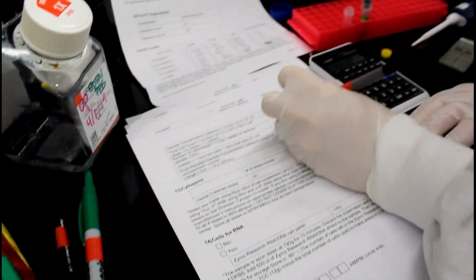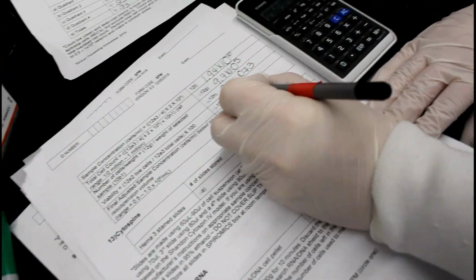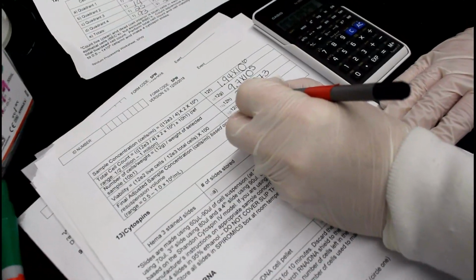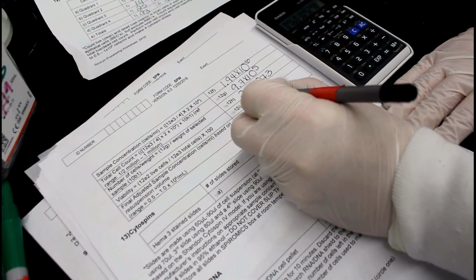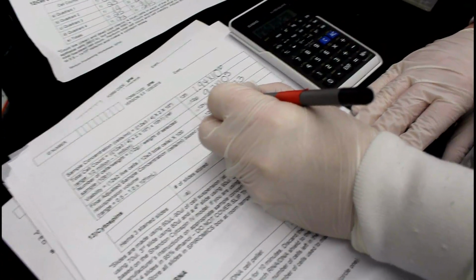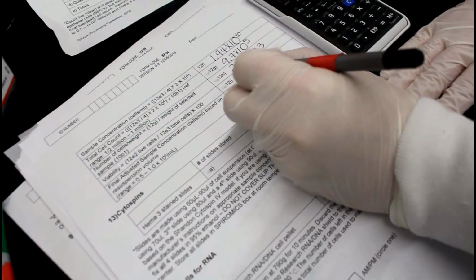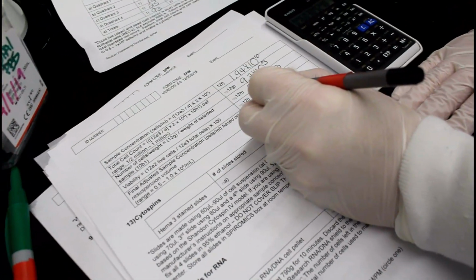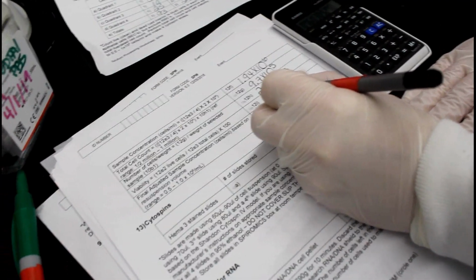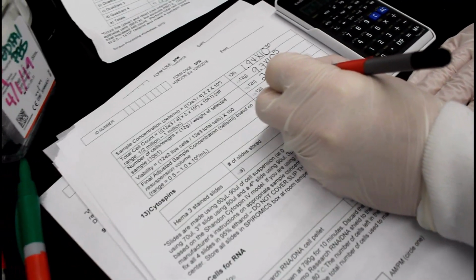Once you have that number, you will multiply that by the volume of the sample. Determine the total number of cells per gram of sample by dividing the total cell count by the weight of the processed sample from earlier in the procedure. The viability is determined by dividing the total number of live cells by the total number of live plus dead cells times 100.